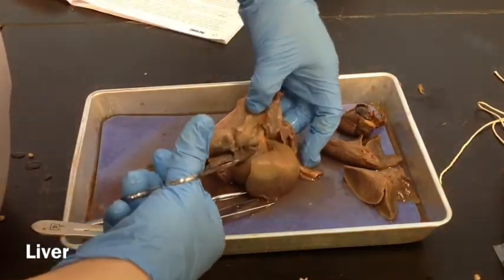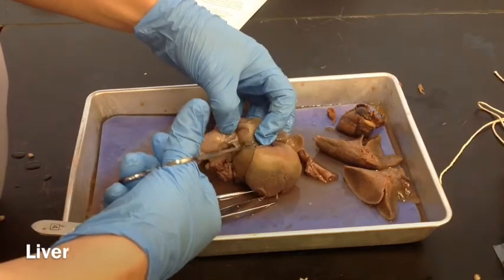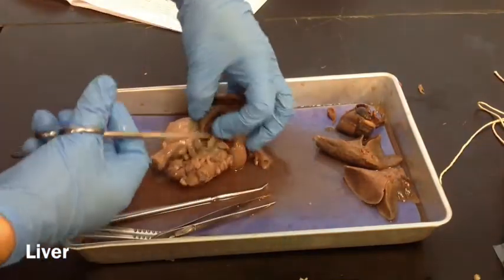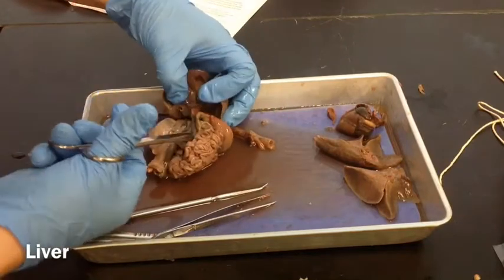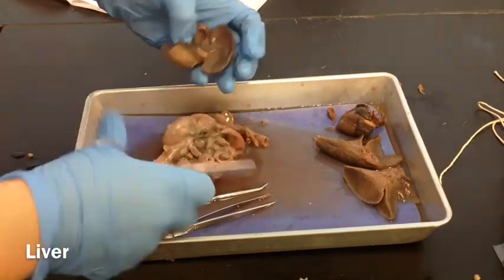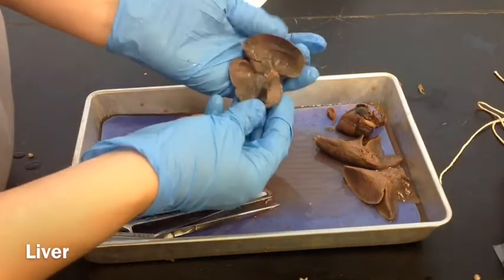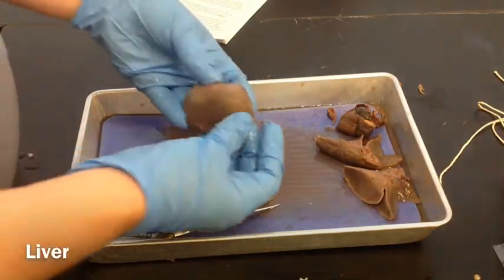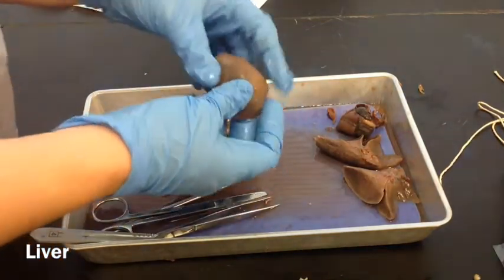So now we have the liver almost free. There we go — that's the liver, all of that. So you're going to want to measure it and weigh it, mass it, and record those things in your autopsy report.